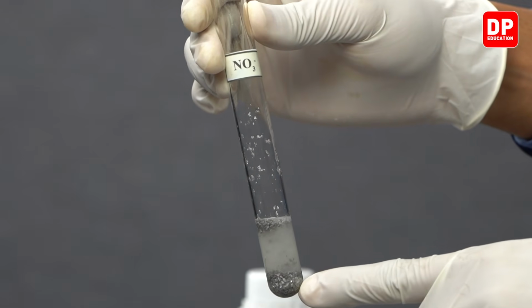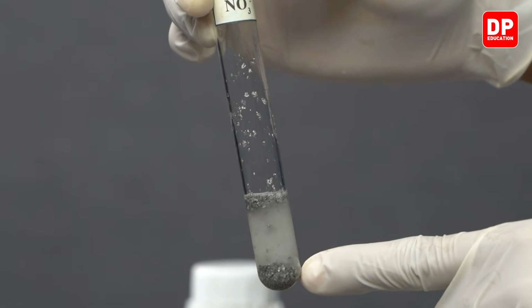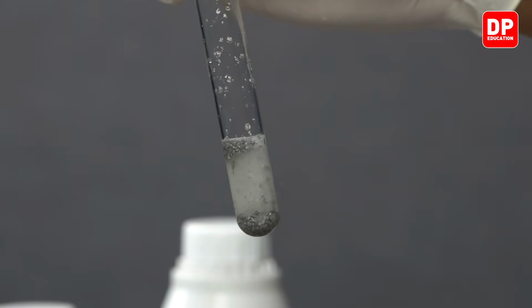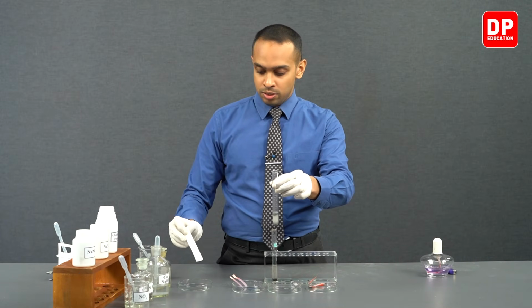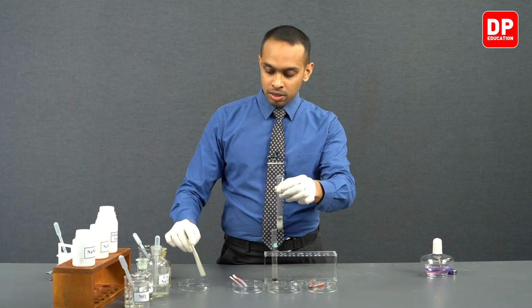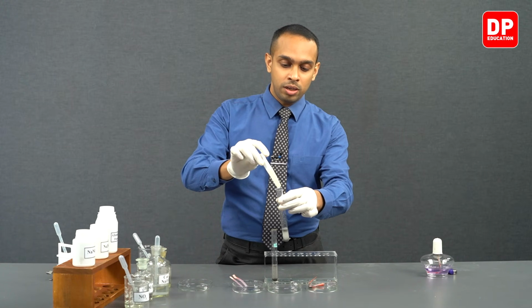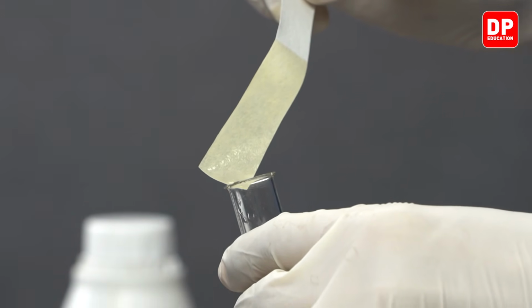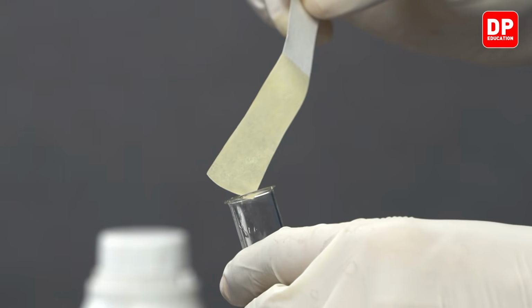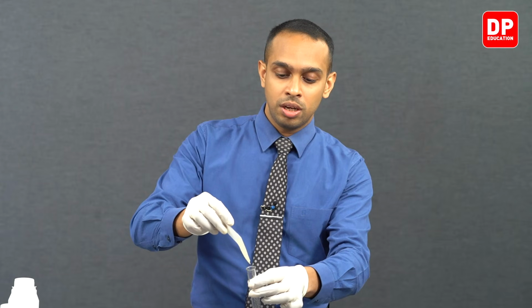Now students, you can see when we react nitrate ion solutions with aluminium and concentrated sodium hydroxide, we produce a gas here. Let's test if it is in fact ammonia. Let's take a filter paper soaked in Nessler's reagent, and let's hold it over our test tube. If it is in fact ammonia, this filter paper soaked in Nessler's reagent should turn to a brown color.